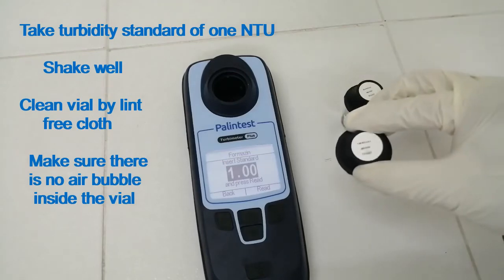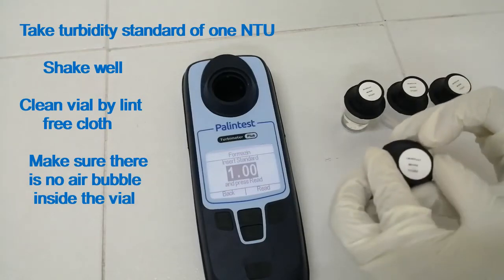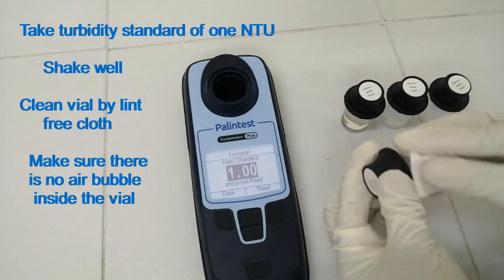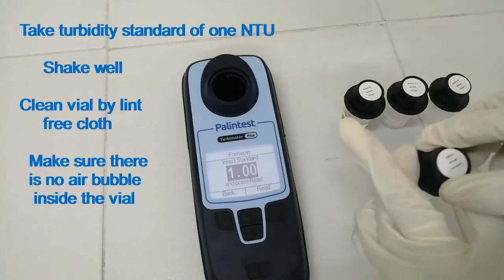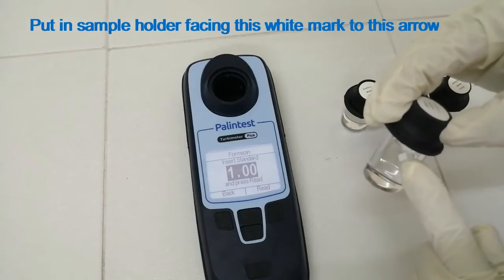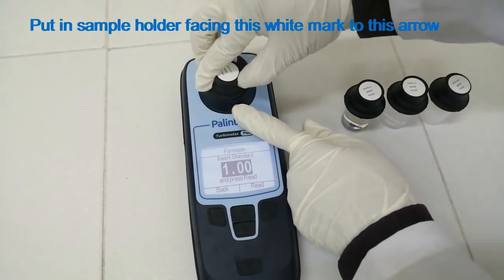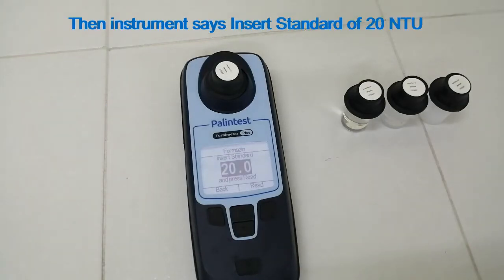Take the turbidity standard of 1 NTU and shake well. Clean the vial with the lint-free cloth. Make sure there is no air bubble inside the vial. Put it in the sample holder facing the white mark to the arrow. Now press Read from the keypad. The screen says reading is running.